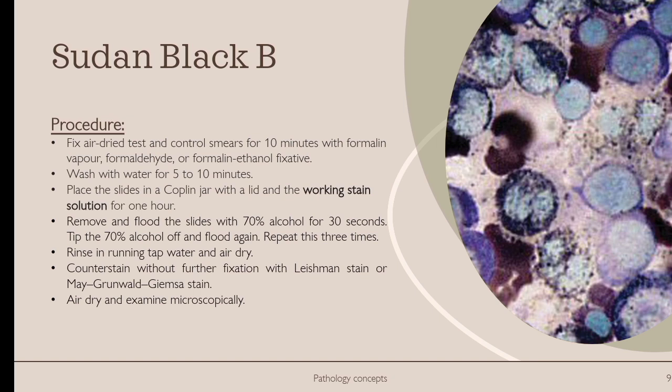Rinse in running tap water and air dry. Counterstain without further fixation with Leishman stain or Giemsa stain. Air dry and examine microscopically.